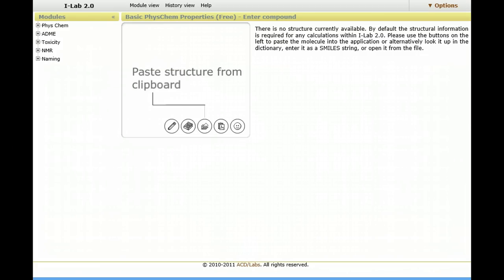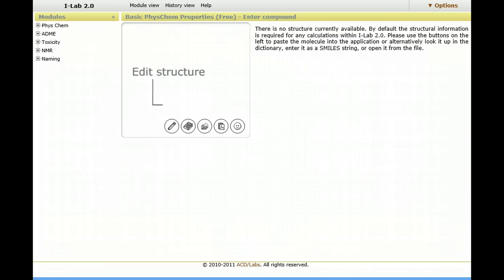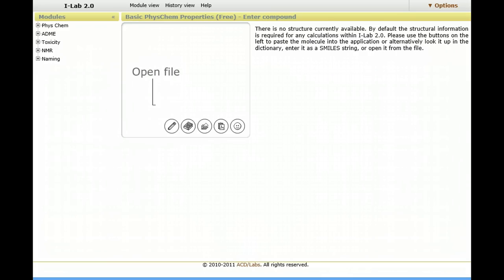Alternatively, you can draw a novel chemical, one that you may be synthesizing or working on studying, and then generate properties.